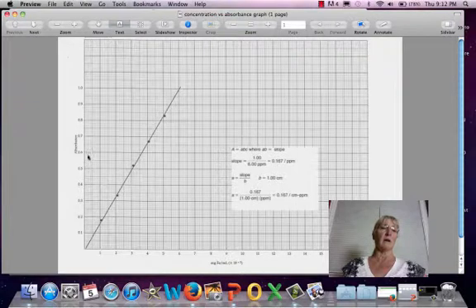And then over here, on the vertical axis, you're measuring absorbance. So someone constructed here, with known concentrations of iron ions, a graph that plots concentration versus absorbance. So far, exactly the same as what we've done.